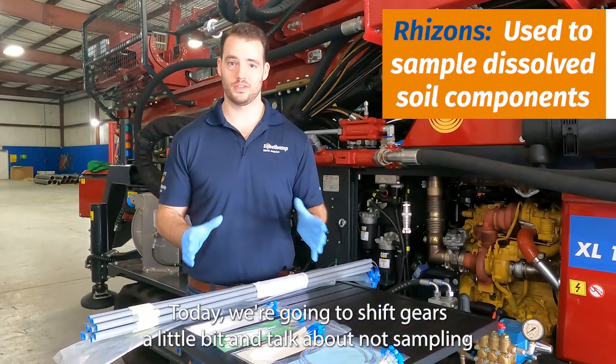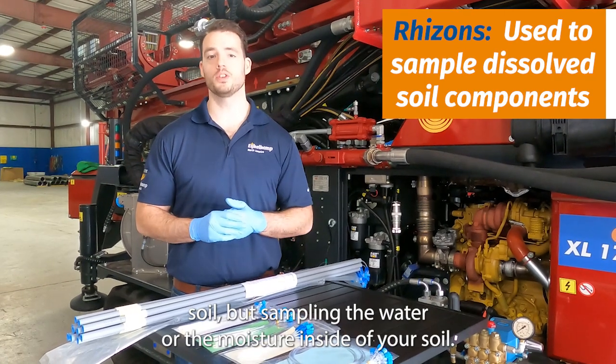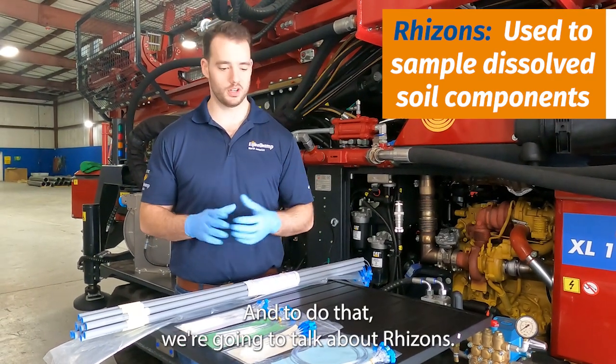Hi, this is Alex from Eijkelkamp and today we're going to shift gears a little bit and talk about not sampling soil but sampling the water or the moisture inside of your soil, and to do that we're going to talk about rhizons.